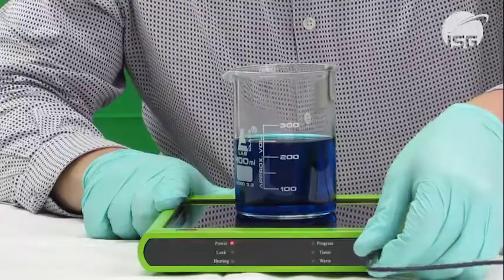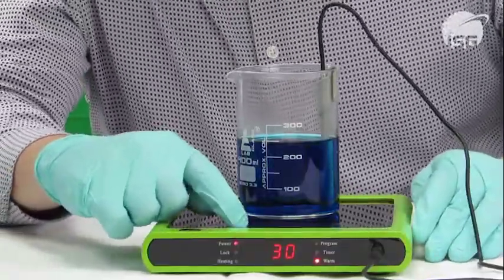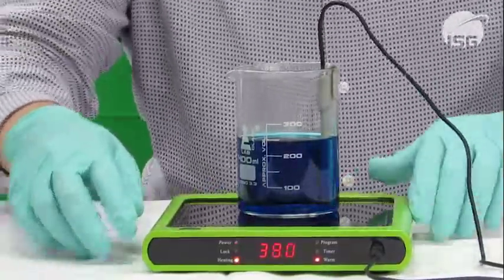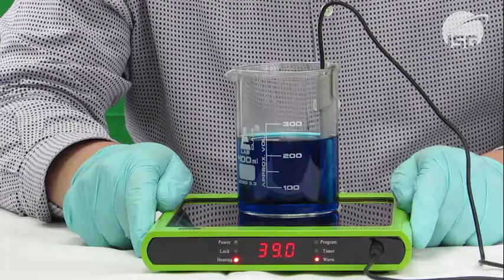The Advanced NanoHeat Hotplate has a temperature probe which allows liquids to be heated to 90 degrees in 1 degree increments to an accuracy of 0.5 degrees centigrade. When using the external probe, the LED display shows the current liquid temperature in centigrade to 0.5 degrees accuracy.